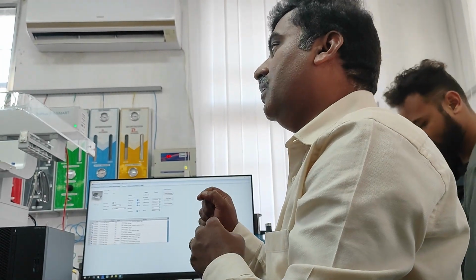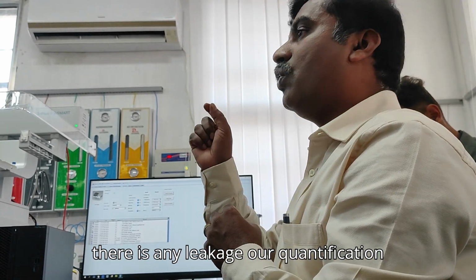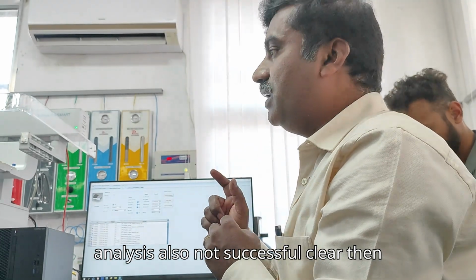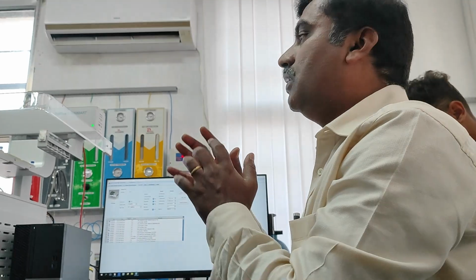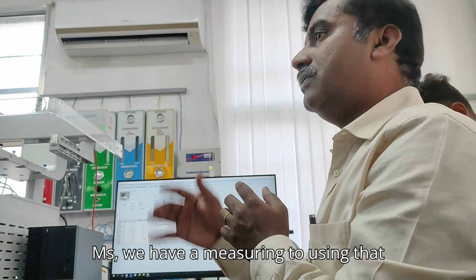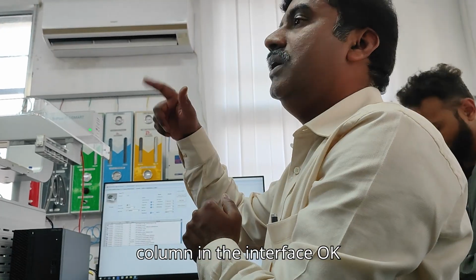Then our analysis goes smoothly. If there is any leakage, our quantification also goes bad. Sometimes qualitative analysis is also not successful. Clear? Then the other end of the column you install based on the detector you select. The length of the column insertion, everything varies from detector to detector. If it is MS, we have a measuring tool. Using that measuring tool, you can connect the column in the interface.